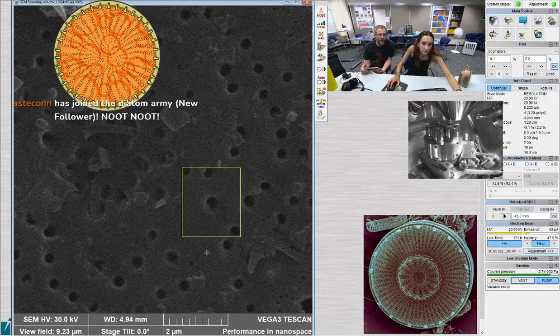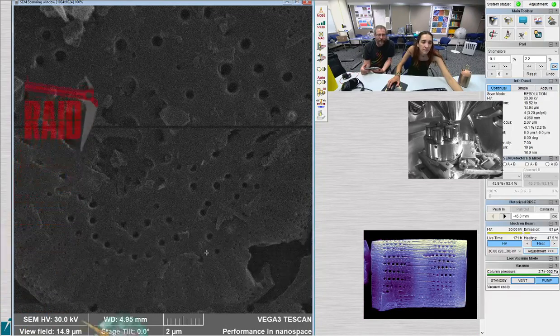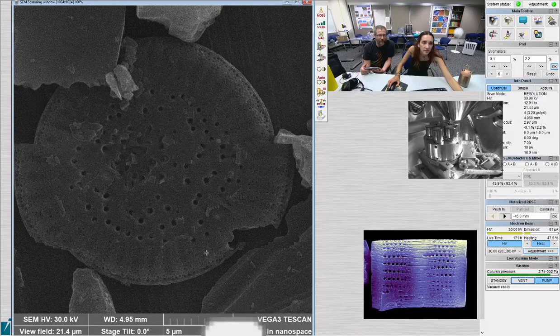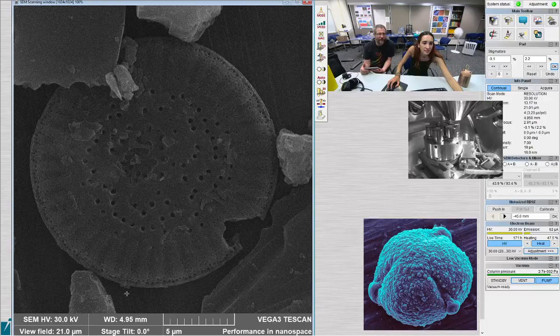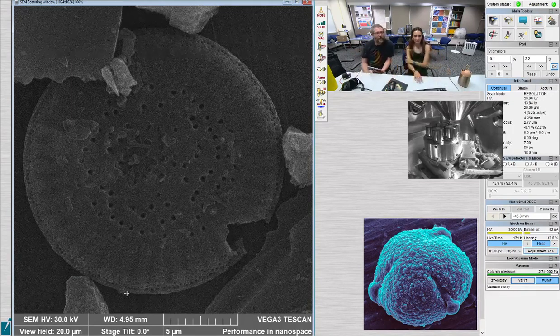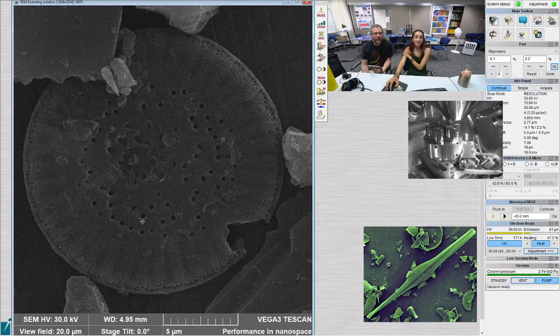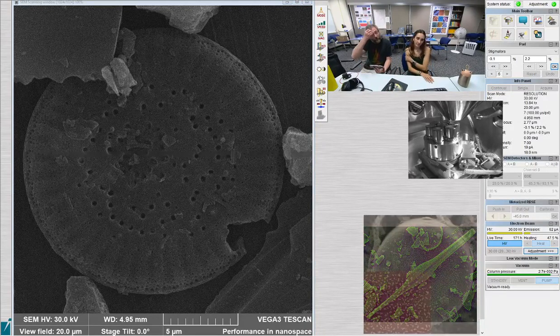Ooh, what is this? We're looking at diatoms in the scanning electron microscope. That's interesting. It's flat and it has areolae all over the valve face. And then the valve face is kind of reticulate. You should get a picture. Yes. Probably we need to fix the... can you set the speed to 7 and hit auto brightness contrast? Yes. Just so that it lightens up a little bit. It's a little dark.